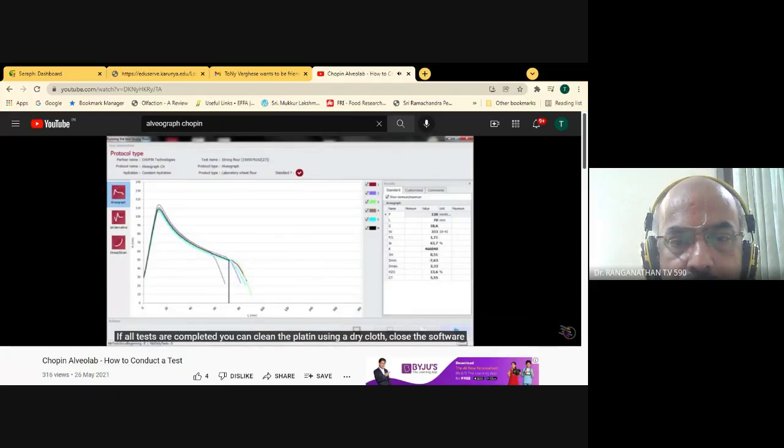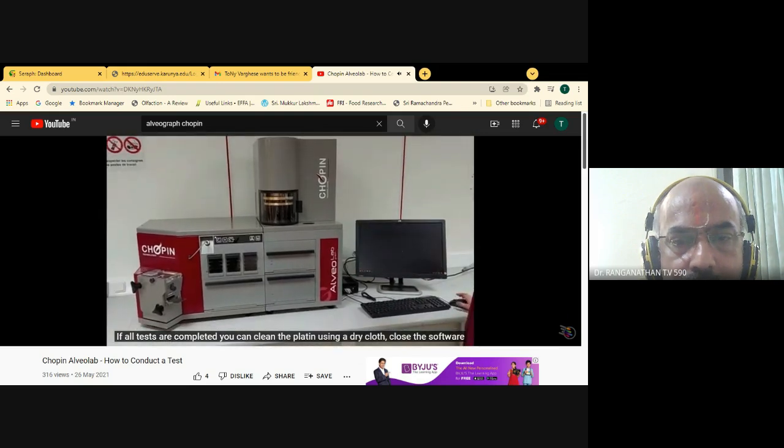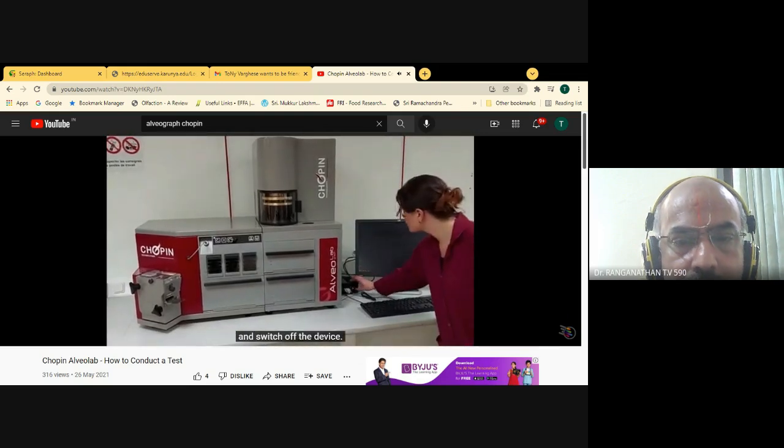If all tests are completed, you can clean the platine using a dry cloth, close the software, and switch off the device. I hope this demonstration was useful.